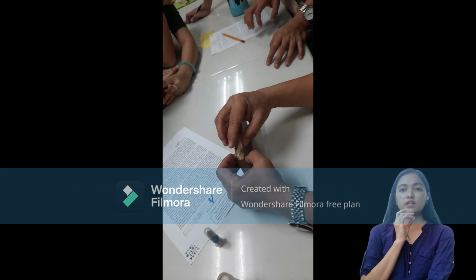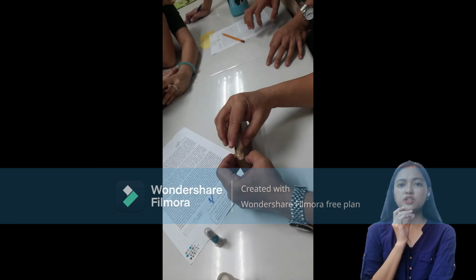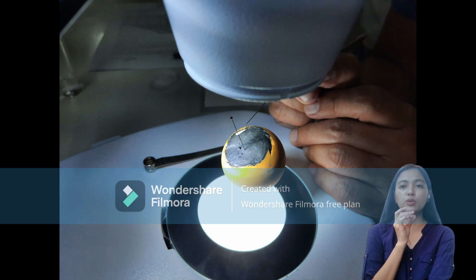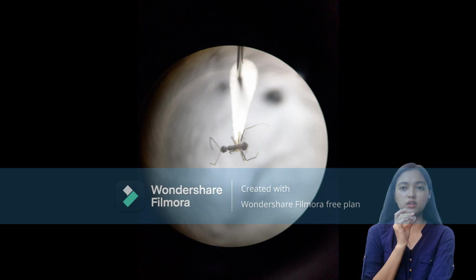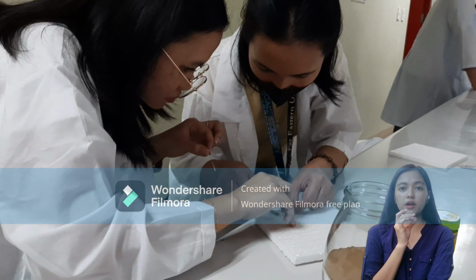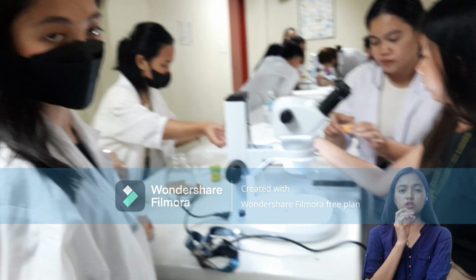The group was given a task of collecting various insect species found within the science building vicinity and its surrounding area. To accomplish this, we employed both active and passive sampling techniques by utilizing sweep nets, baits, and the general hand collection method. After preservation, small insects such as ants were mounted on a paper stage to keep them steady while viewing. Larger insects, on the other hand, were pinned on a styrofoam and then viewed using a stereo microscope to further examine their morphology.